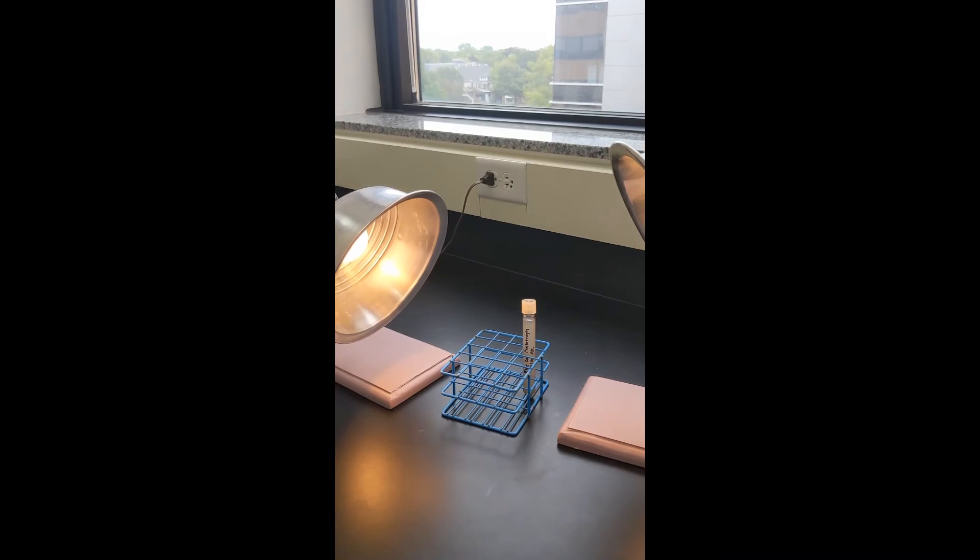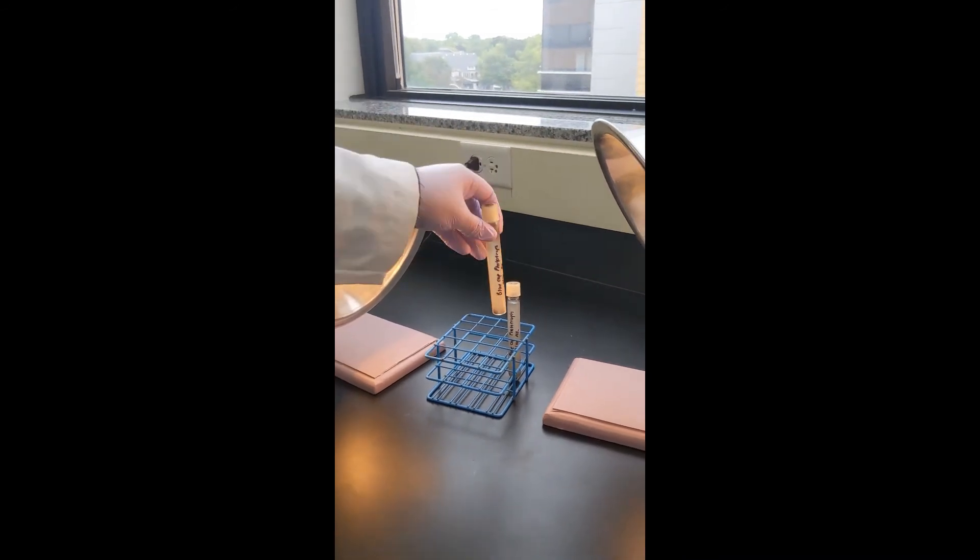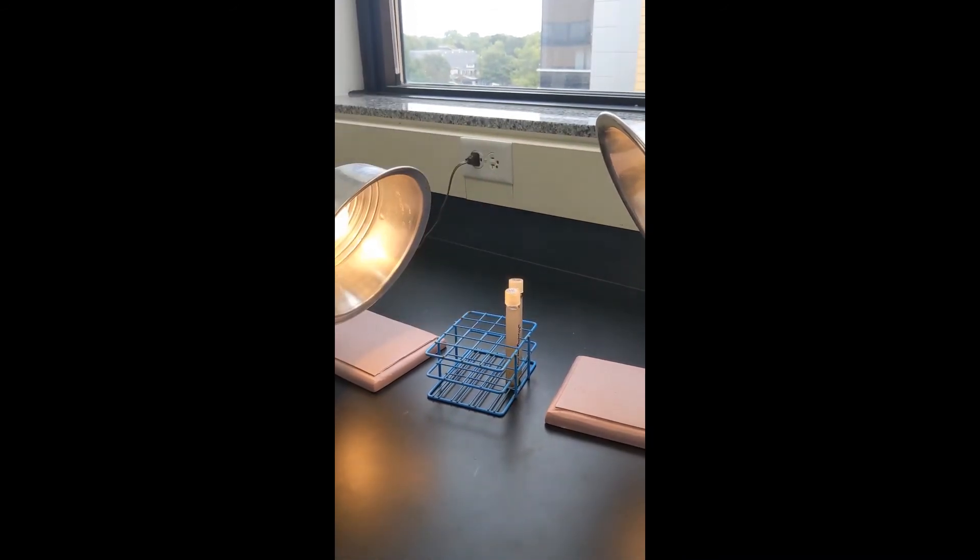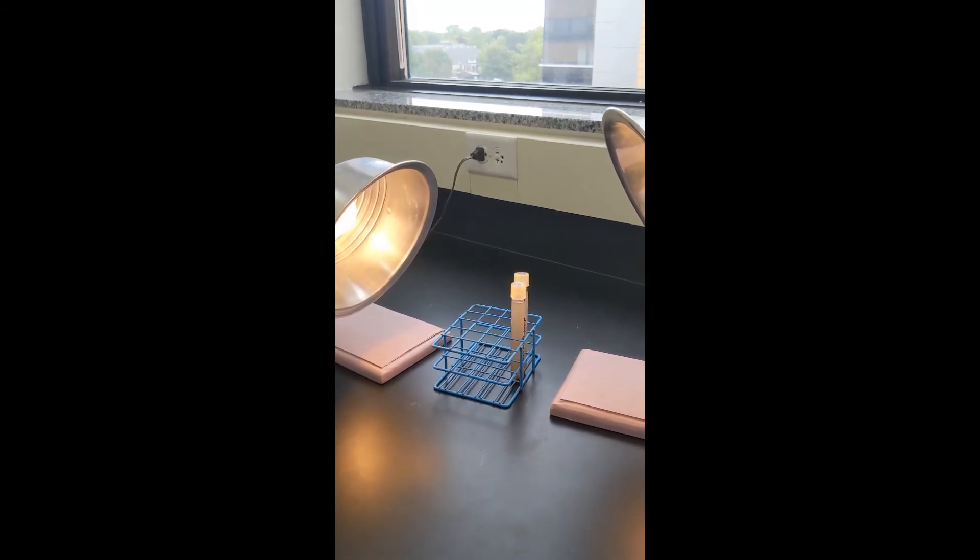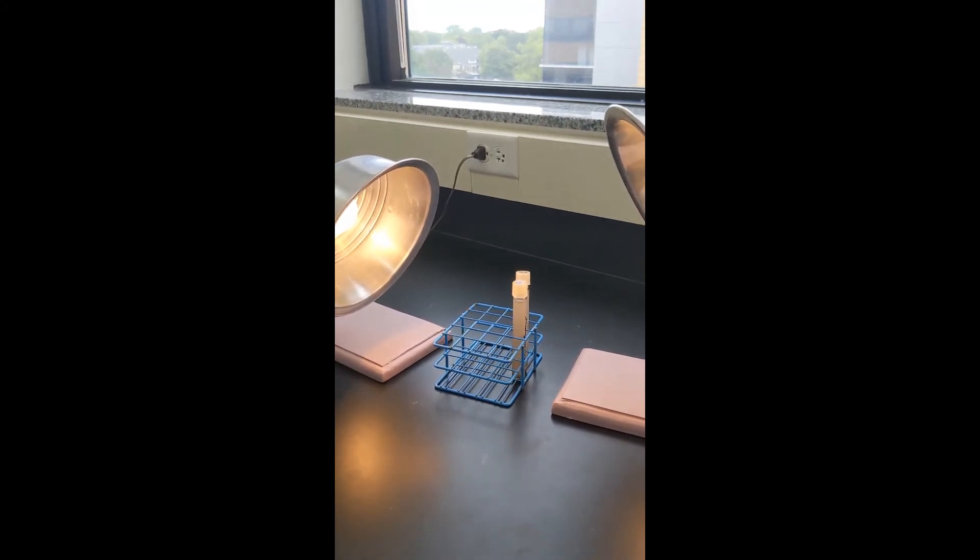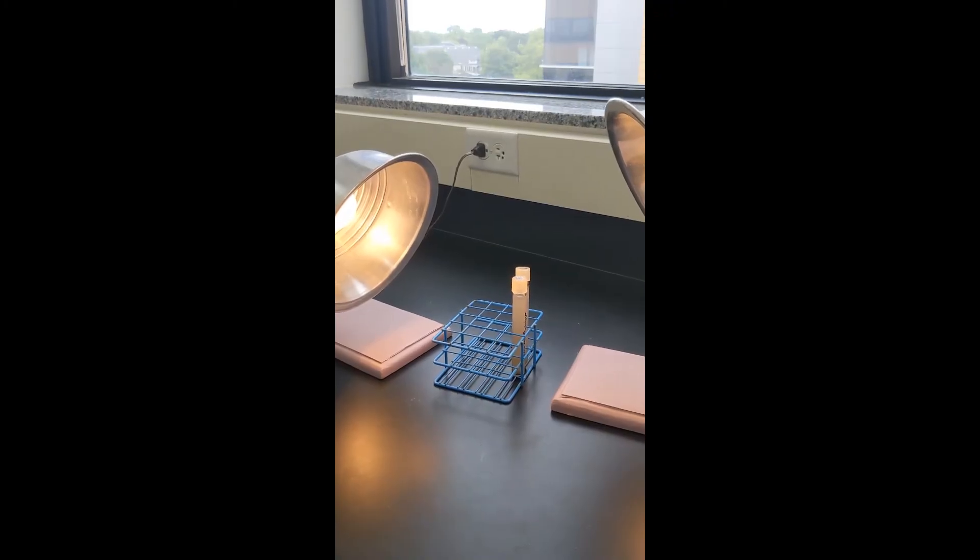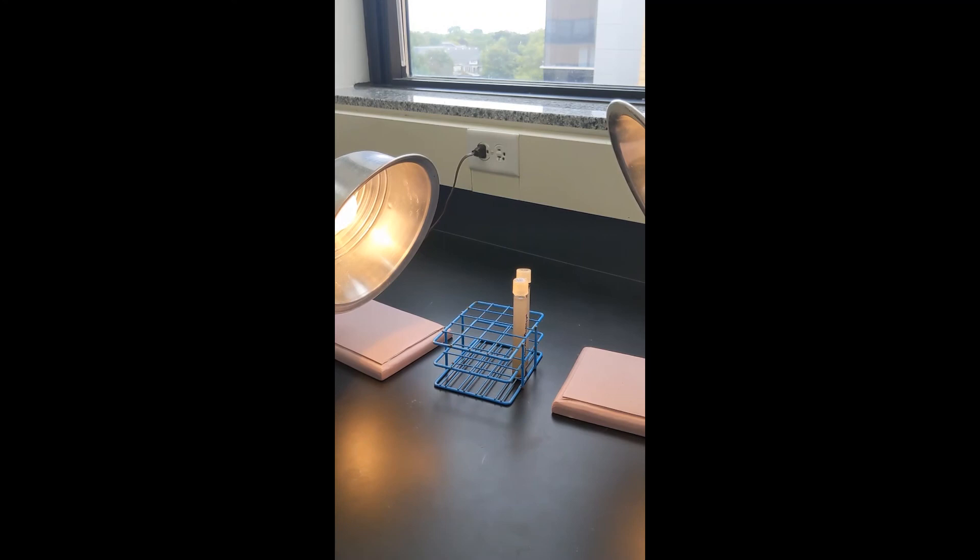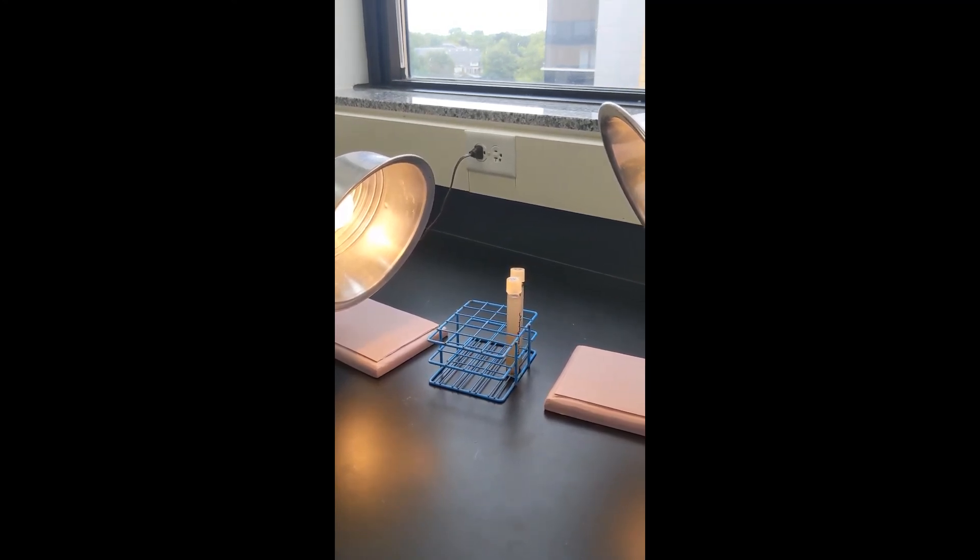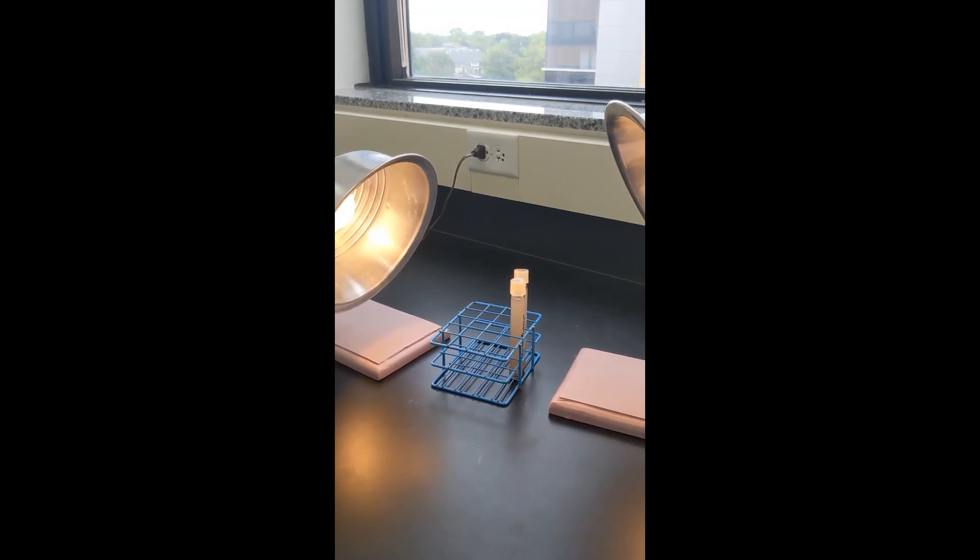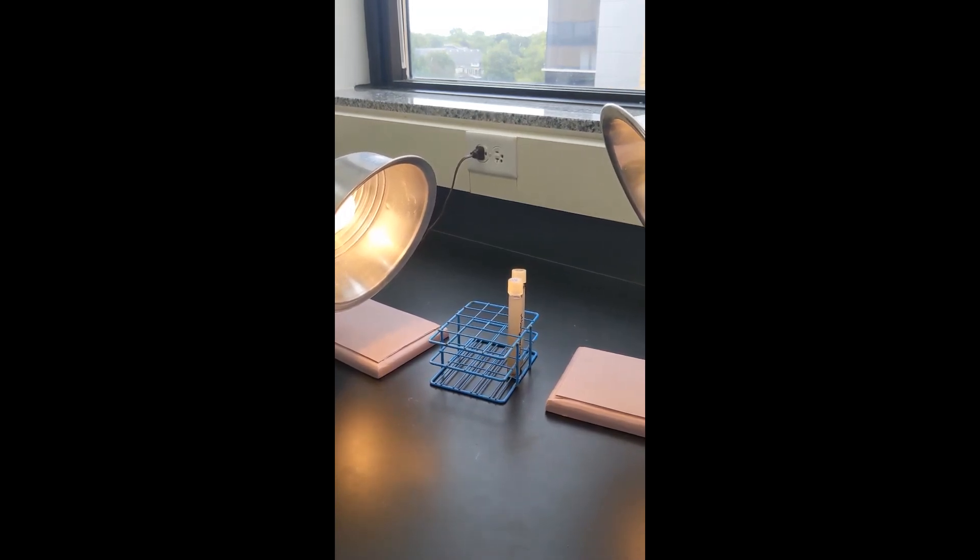All right, here is our light setup. All we have to do is stick the vial in there and let it grow. Normally we would check in every lab period and look for some pigment changes. Seeing as we're going online, we can't really do that, so we as the lab TAs will check in on it and show you the results.